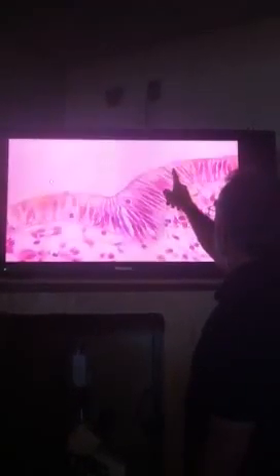If we actually take a close-up, you'll begin to see the simple columnar on the top again. Not a great slide, but there. So you'll see that this is the connective tissue with the columnar on top, all simple columnar across, no cilia, nothing at all. But you can see huge goblet cells. These are the goblet cells, like that. They'll continually secrete the mucus. You hope at least.